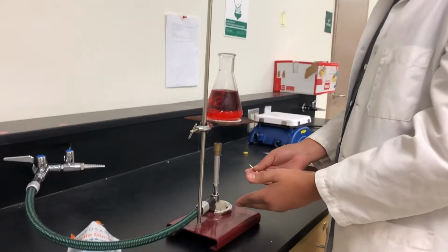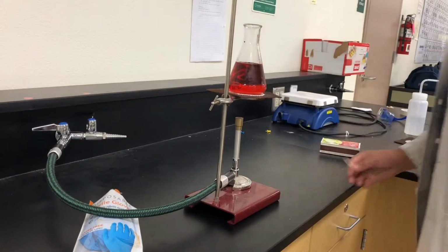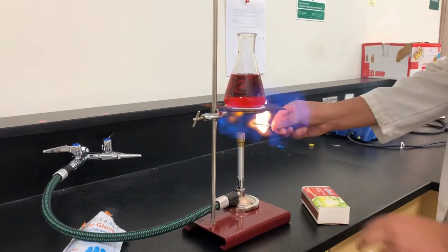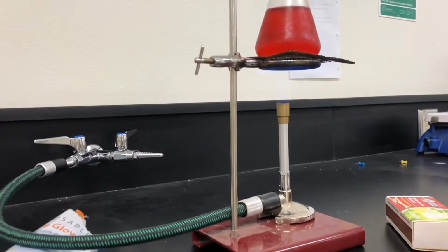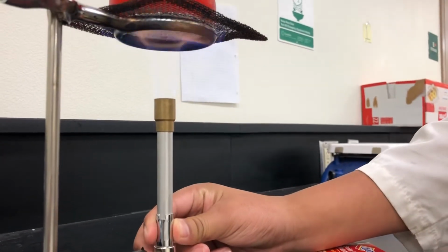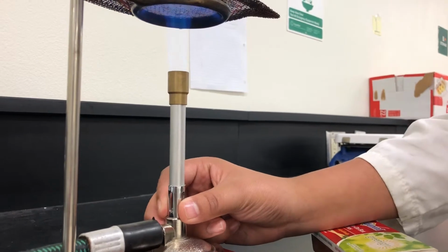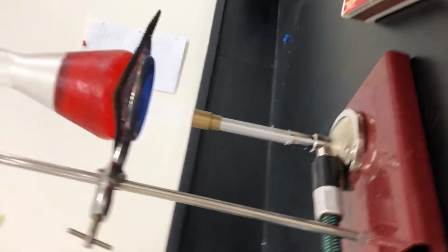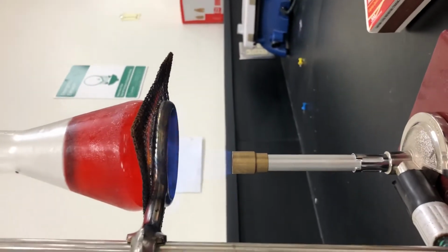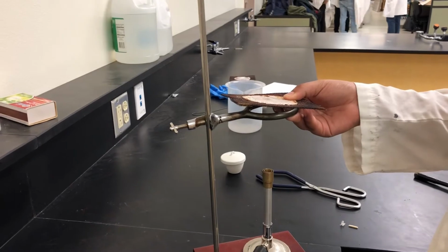So, before you start your Bunsen burner, you wanna make sure these things are snug. And you turn on the gas. Alright, so you get your thing, and you light it. To adjust it, you move this. This is your regular flame. And your roaring blue flame. Always make sure your fire equipment is stable.